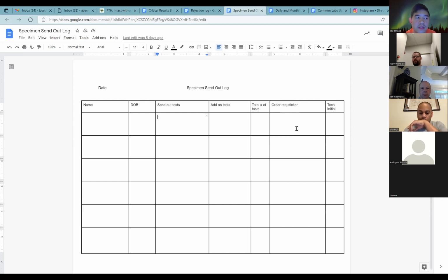All right, and then the last big thing is after you do print off the requisition form, make sure the PA signs it before you stick it in the bag. That's really just to make sure that whoever clicked on lab interface did indeed get the right tests on there. There are a few tests that look similar, or it might be a different methodology, or might have special requirements. It's really the PA's job signing off on it to say, yes, these are the tests I want, and that we're making sure we're not sending off for a herpes PCR when it should have been a herpes antibody. That makes a big difference. One is the wrong test and not going to catch it at all. So make sure the PA signs it.